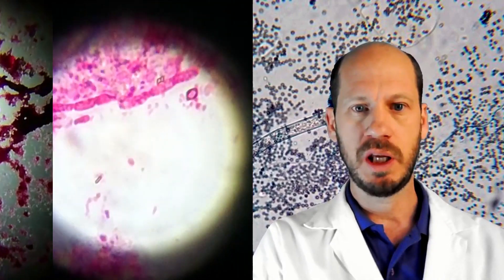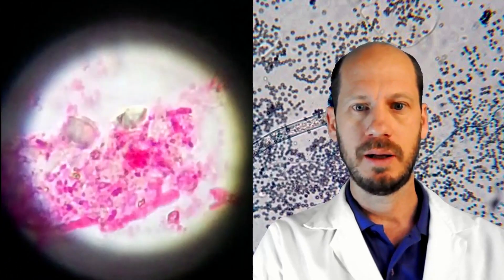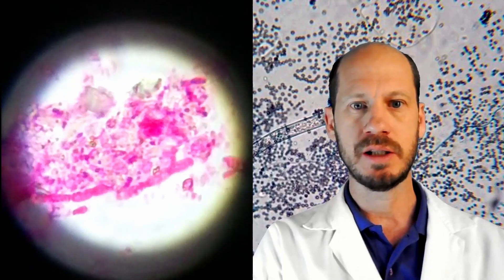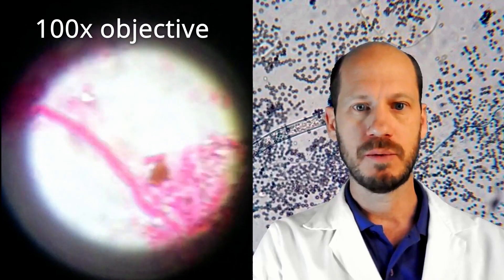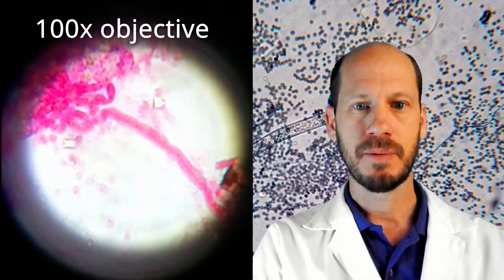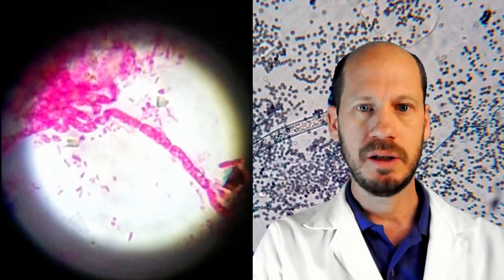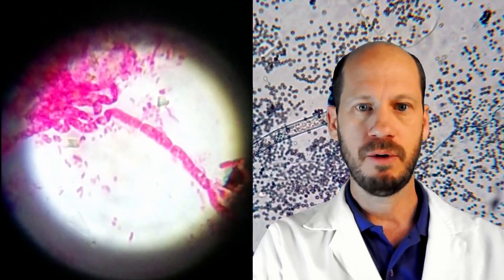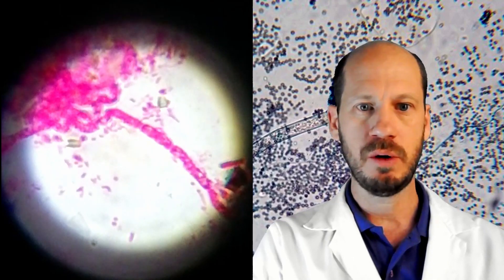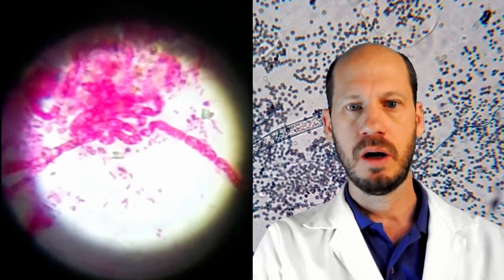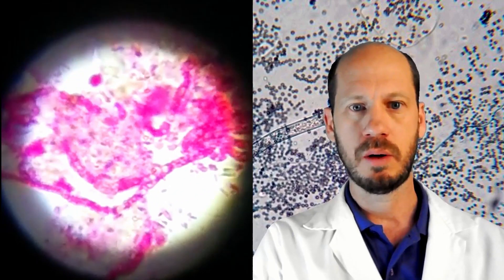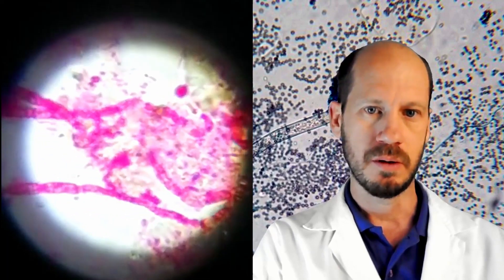Then you can move on and zoom in with the next magnification. Here is 100 times already. You will see here some hyphae in the soil and some bacteria also. We can focus up and down. Some rod-shaped bacteria, the small ones here are bacteria, and the big ones look like some hyphae on the soil.